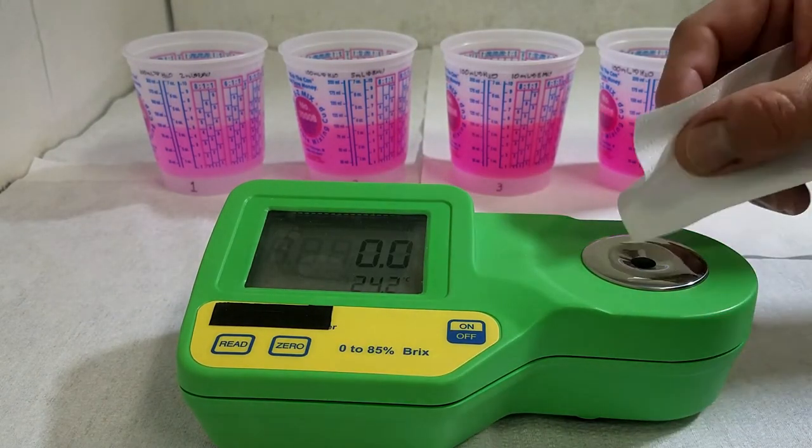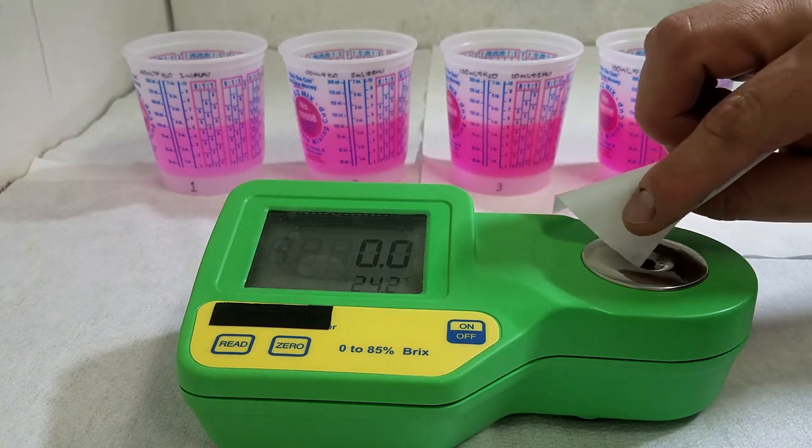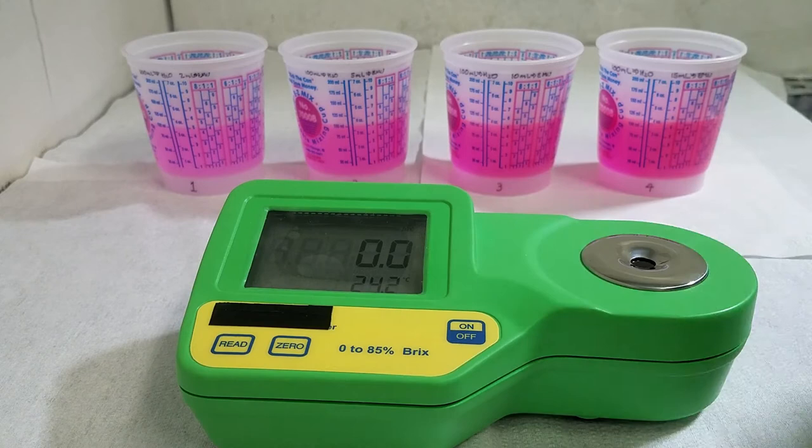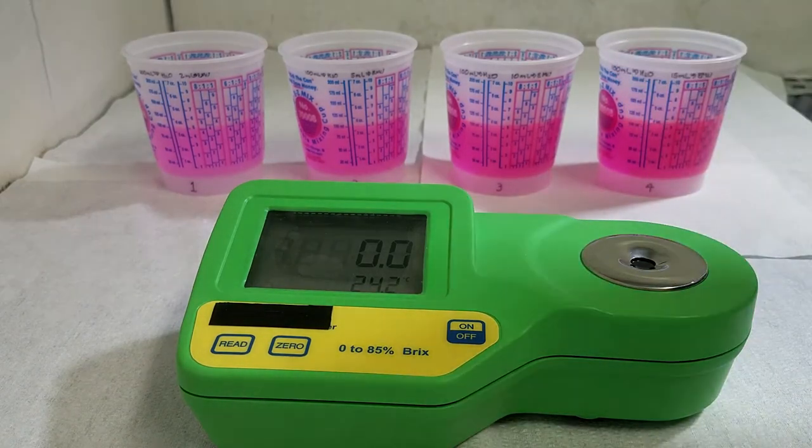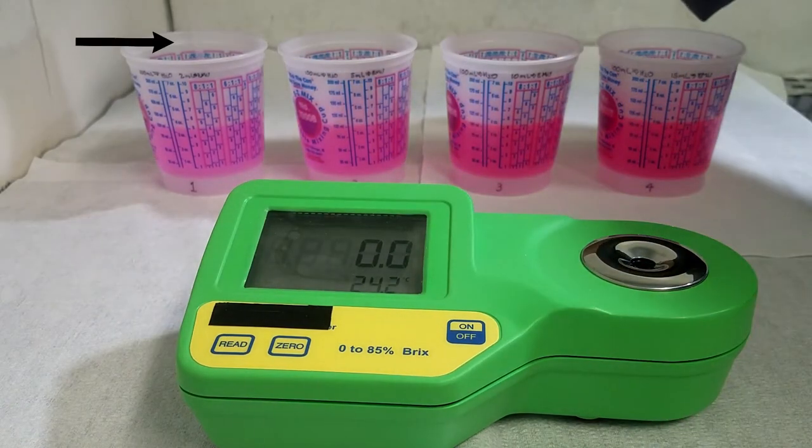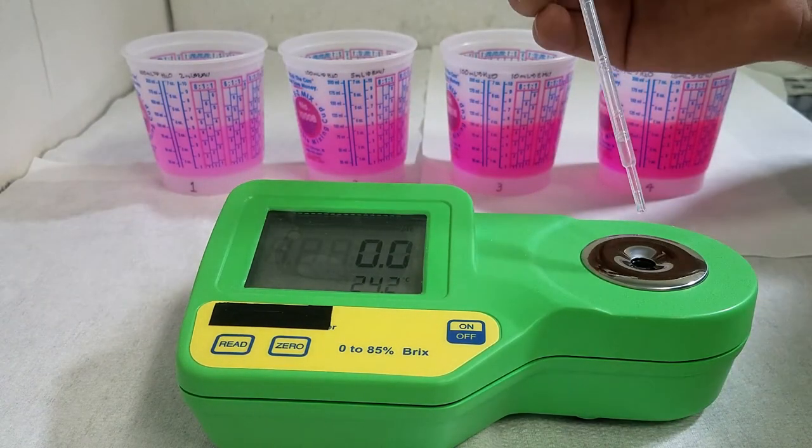If we don't get 0.0, then we are going to use the zero key to get the 0.0. That is the reference point. Remember to clean and dry the window sample to be ready for new measurement.